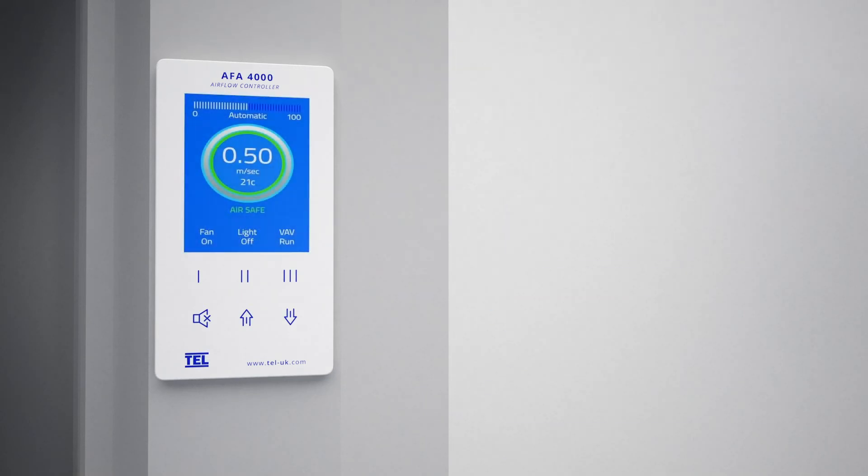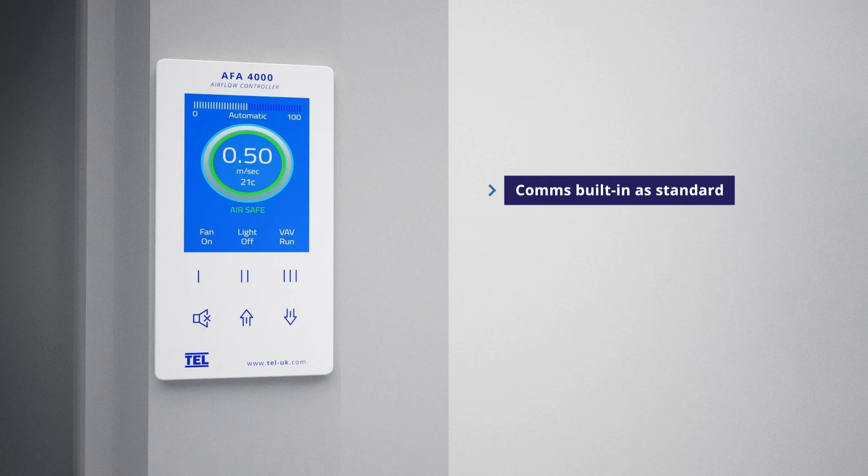The AFA 4000 has comms built in as standard and can be used with either Modbus or BACnet protocol.